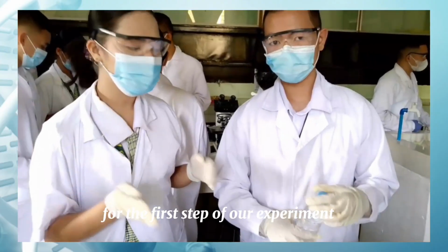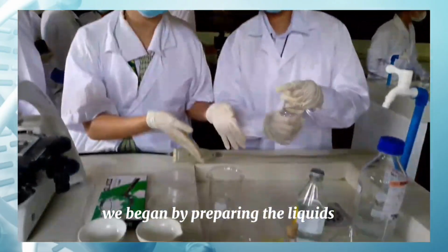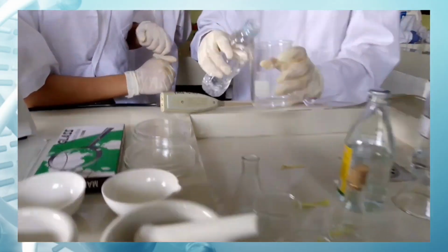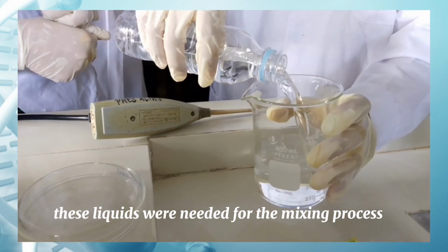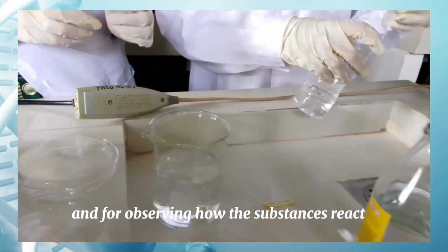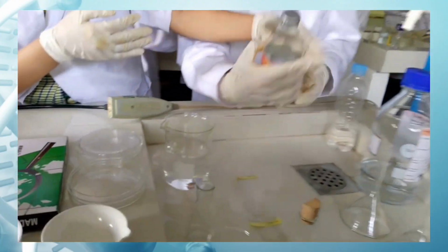For the first step of our experiment, we began by preparing the liquids that would be used for testing the different adulterants. These liquids were needed for the mixing process and for observing how the substances react when combined with different solvents.